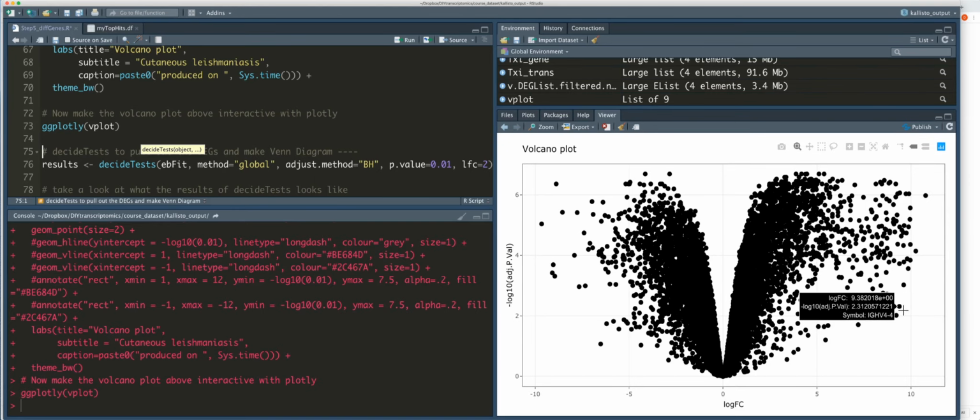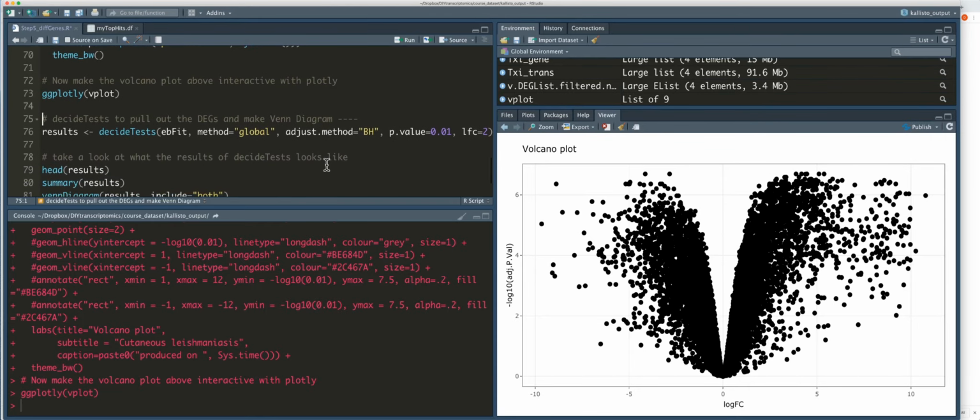So one of the things that we've described, in collaboration with Phil Scott, is that this profile in the skin of these patients is really one characterized by a robust inflammatory response. Many of the genes that show up in this list as being associated or induced in patients with disease, if you block those genes, you can actually also block the development of the skin disease, and that's work that Phil Scott's lab has done in mice. So it's a really useful way to move through your data and interpret it directly in RStudio.